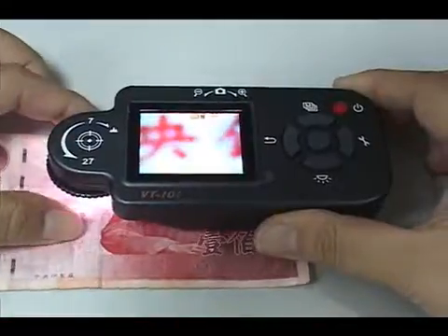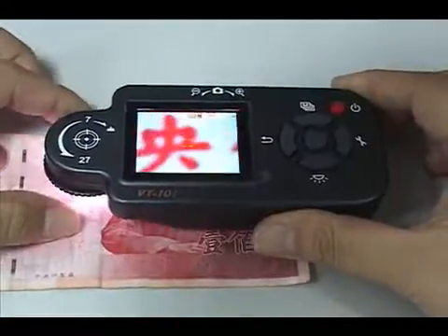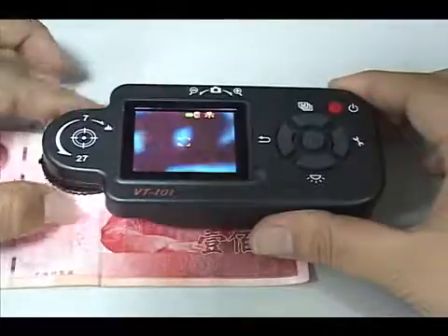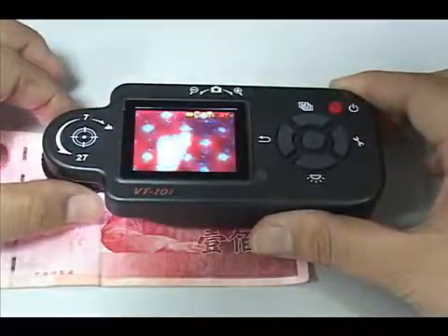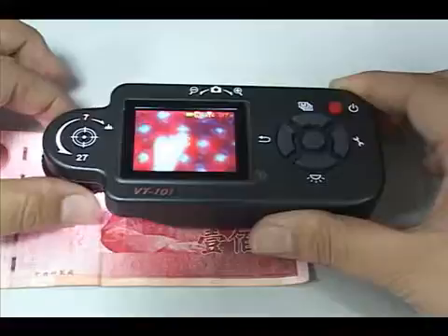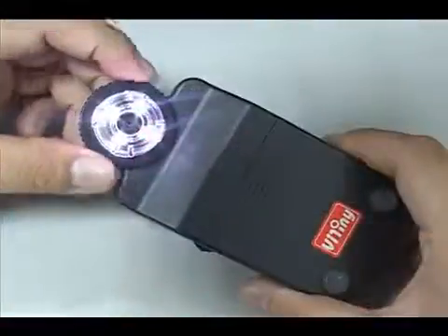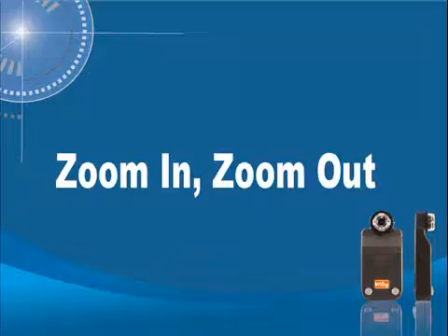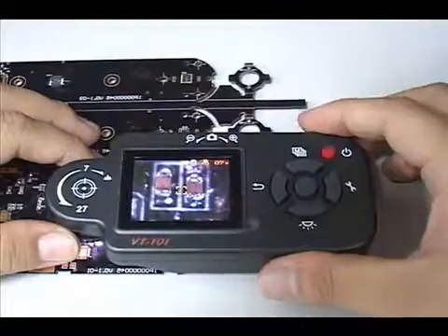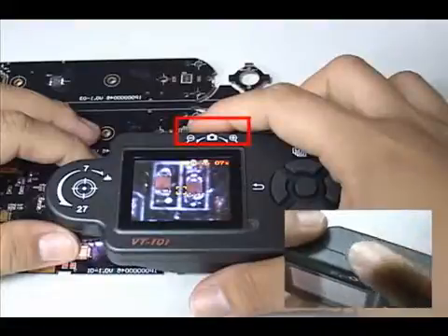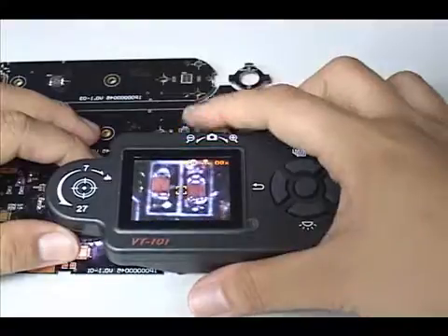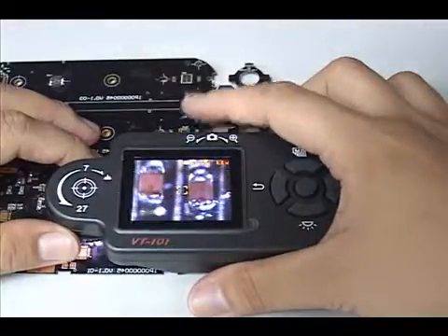Adjust focus to make the image clear. This back dial can zoom in or out by turning left and right, and the image will be reduced and enlarged accordingly.